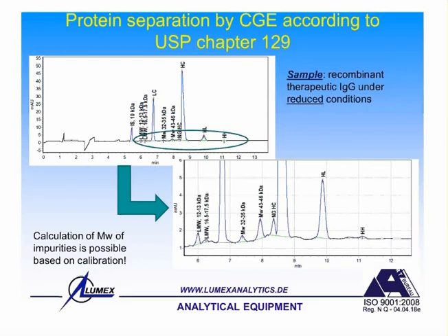Okay, I see one of the questions here. In a seawater analysis, could the amount of sodium chloride mask other ions, disabling their analysis? This type of sample should be pre-treated prior to analysis. It's a good question. Thank you very much. I should tell you yes and no, because each method has its certain limitations.